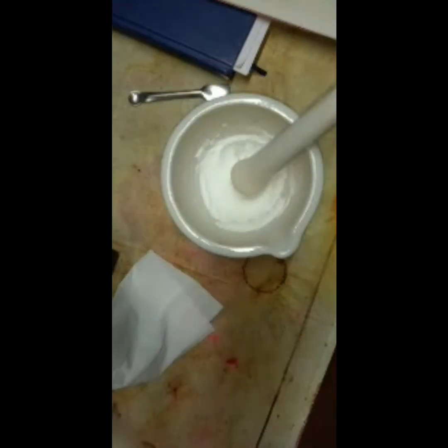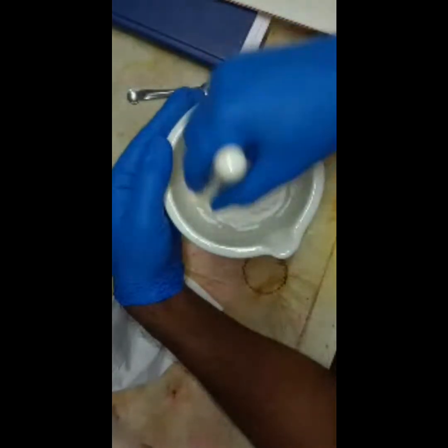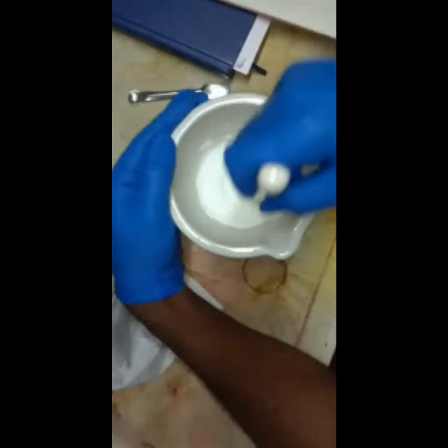Drug release from the micro particles, the dissolution rate of the test apparatus, the samples from the XRD, FTIR or UV analysis from the nanoparticle synthesis.